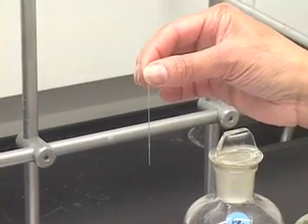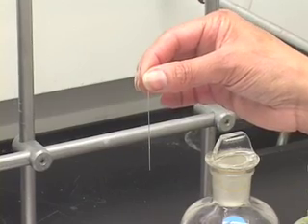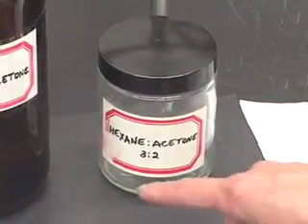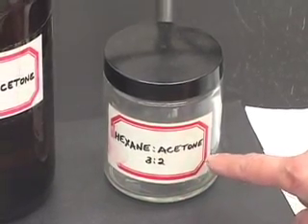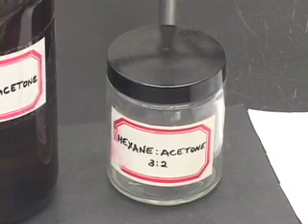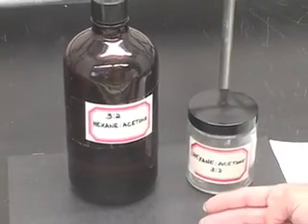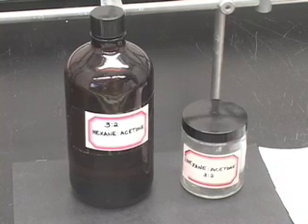These capillary tubes let us withdraw very small samples of compounds that we are trying to analyze. We need a developing jar — this jar has been labeled hexane acetone 3 to 2, which is the developing solvent we will use for the first part of the experiment. Next to this jar, I have the reagent hexane acetone 3 to 2, the developer which we will transfer to the developing jar when we are ready to analyze the sample.